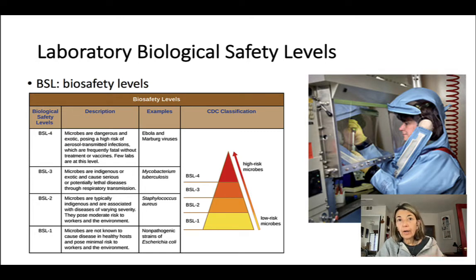Basically there are 4 levels, BSL 1 to 4, and the higher the level, the more dangerous microbes are handled there, which requires both more complex instrumentation and lab setup, and also more stringent practices.